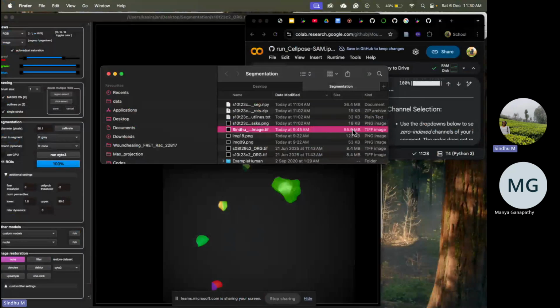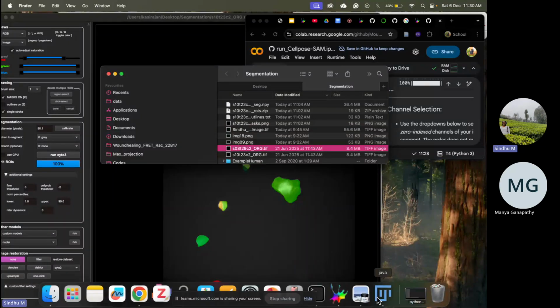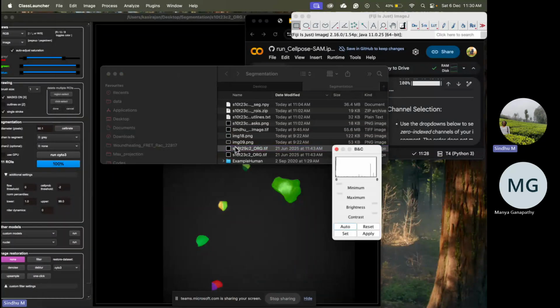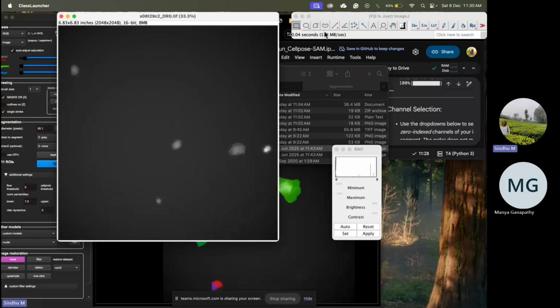This is also a big file because it has these tags. I think this is just a phase contrast image. So for a phase contrast image, the channel, oh okay, these are not phase contrast, but just a single gray channel image.